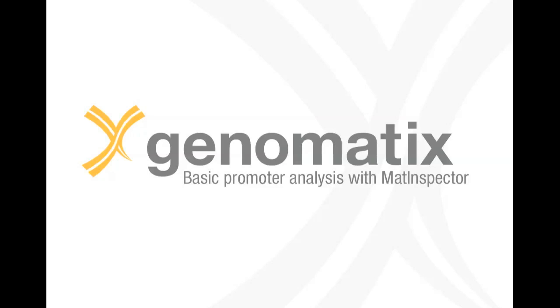As an example, we will analyze the promoters of the human IL-10 gene. Interleukin-10 is a regulatory cytokine which plays a role in inflammation and immunoregulation.